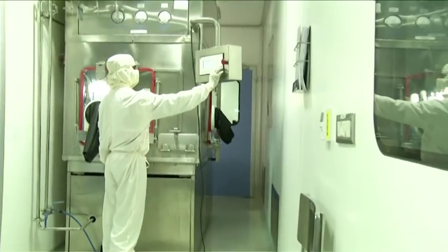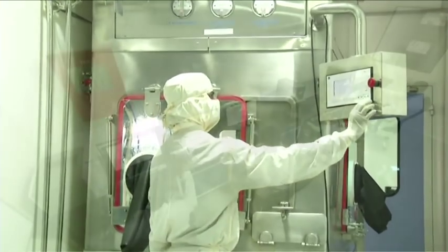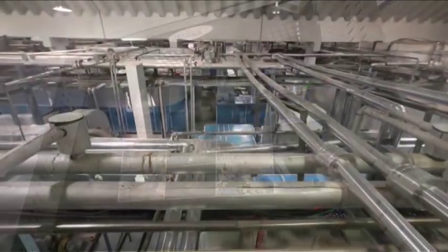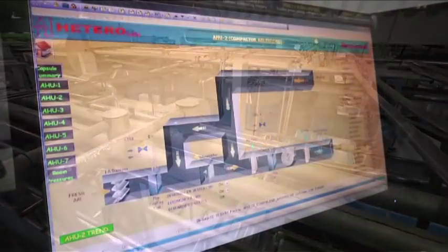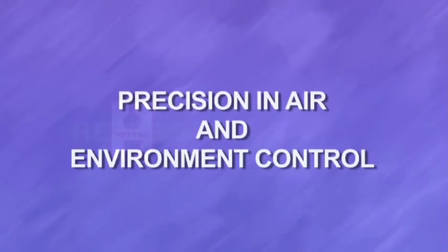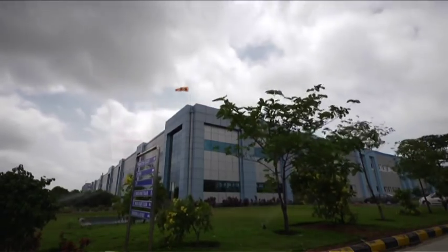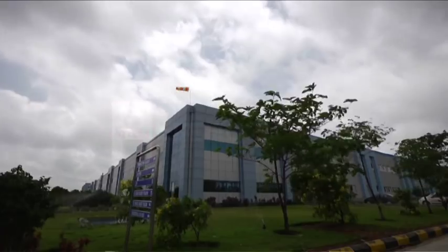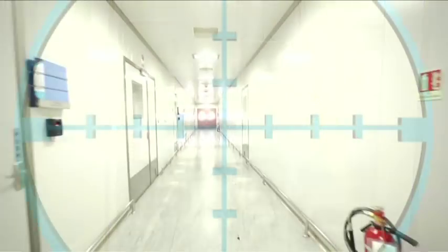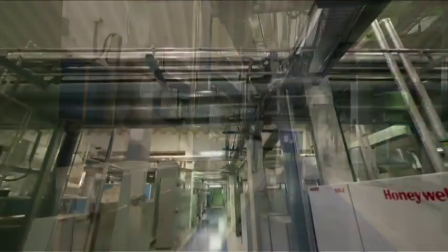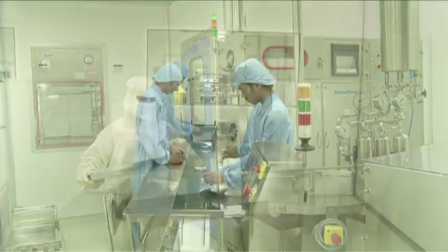The most stringent Class 100 sterile and decontaminated environment for these critical operations is controlled by the building management system which operates 24 by 7. Air and environment control plays a critical role in the manufacture of anti-cancer molecules, the reason why Hetero lays emphasis on nothing but the best technology to purify air to the highest levels. This apart, the most sophisticated systems are used to control the temperature and humidity as required across the various areas of manufacturing and packaging.